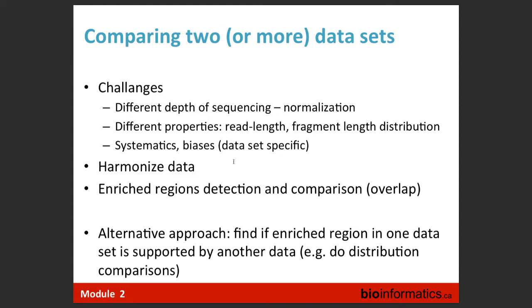So you can even do a kind of differential peak calling using this type of property. If my ranks are very different, people are doing this. Or you can even set your threshold using concordance. If you have two replicates, that's the way to set a threshold. What is a true threshold? As we just said, MACS gives you some p-value, but it's almost an arbitrary score. Some people use 10 to the minus 3, 10 to the minus 4, or 10 to the minus 5, a threshold which is unrealistic. So it's your problem.